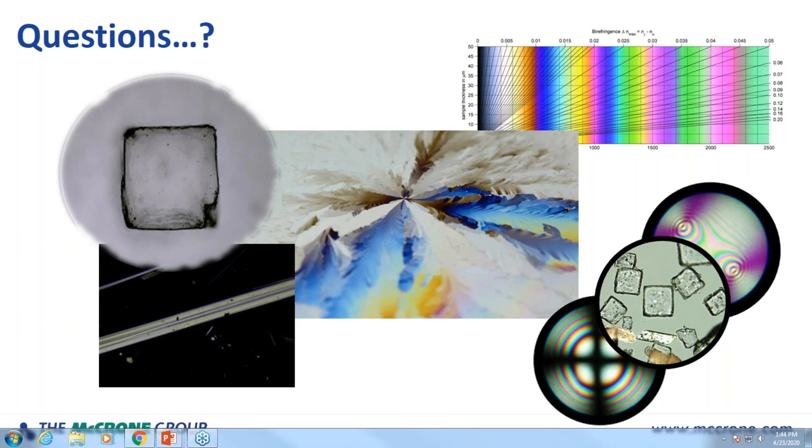The first thing I look at is, is it isotropic or anisotropic? After that, we generally start to look at refractive indices. And then we'll start to look at extinction characteristics. The last thing we usually do is the interference figures, because by then I have a pretty good idea what I'm dealing with, and that allows me to eliminate some other things. But we do here at the college have a specific series of steps that we suggest our students follow to make their job easier.